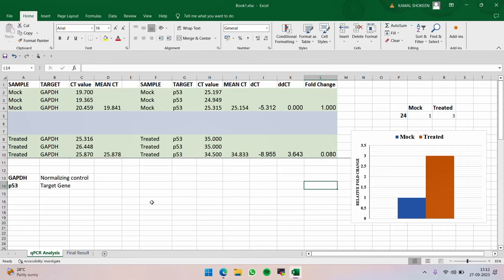Now as I said, we are setting up 40 reactions. So out of 40 reactions, at which cycle are we getting the amplification? In this case 25, in this case 19. So if you are COVID positive, then you will get a CT value lesser than 40. Suppose I am getting a value of 35 and my friend is getting a value of 29. So the doctor will say that guy is more infected with the virus because the CT value is less, and I'm less infected. So this is just telling by the CT value if you are infected or not.